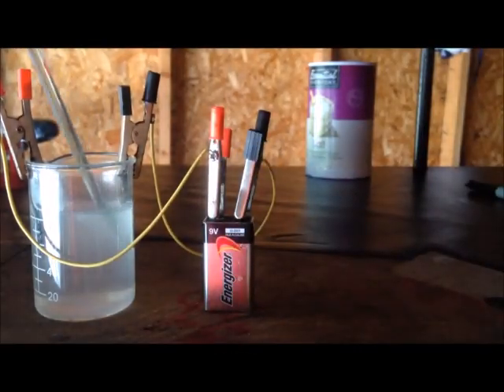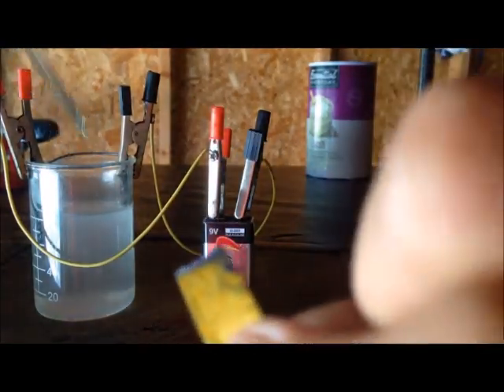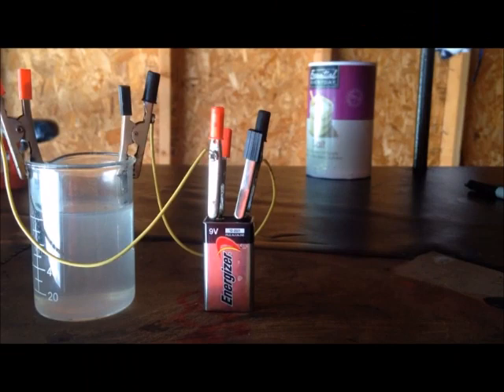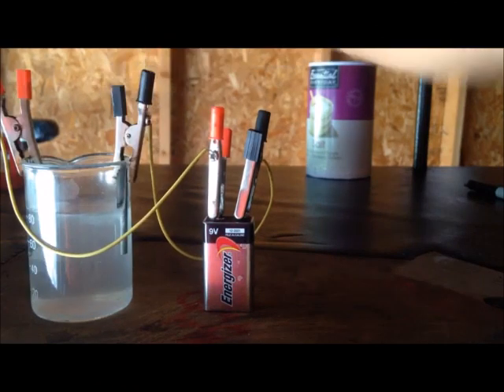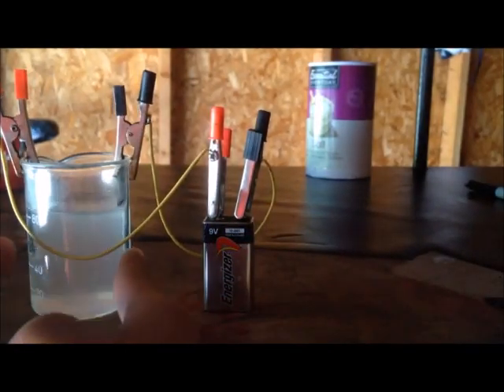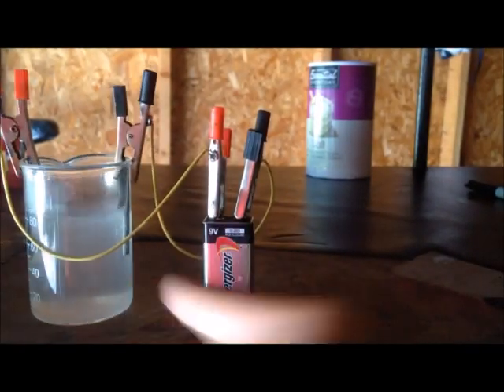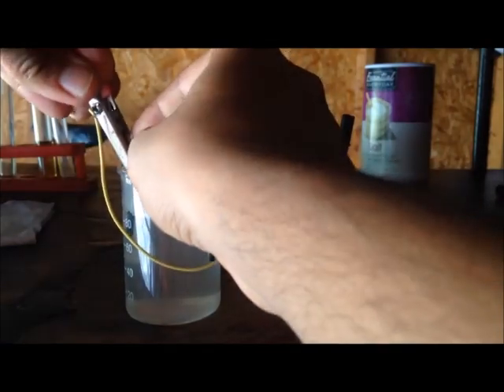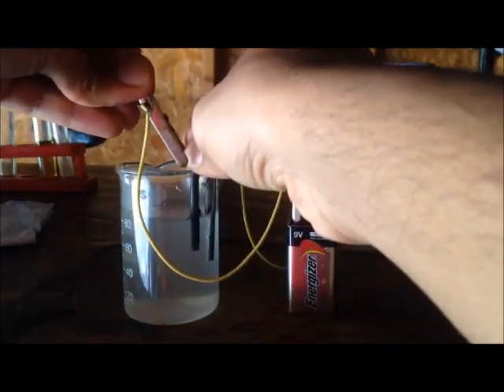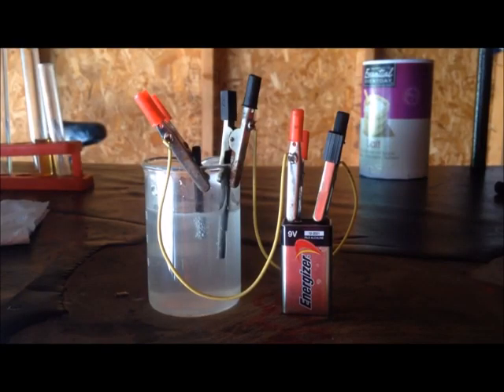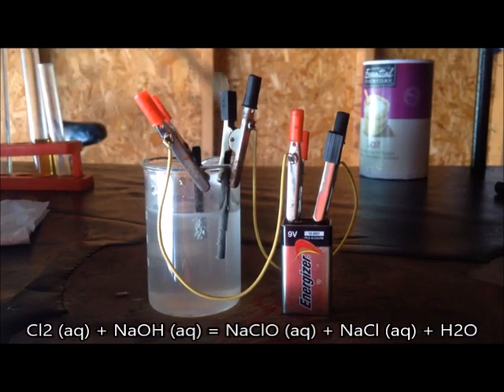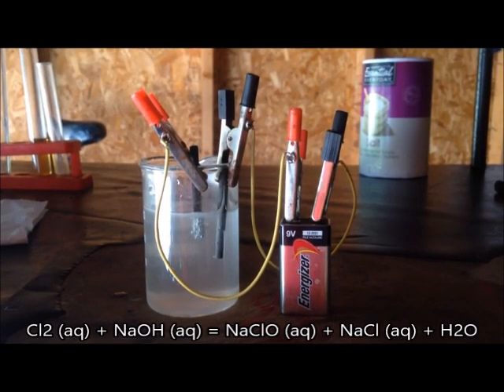To form bleach, we need a second reaction. These electrodes are a little apart from each other, so I'll move this anode near the cathode. The second reaction is between the chlorine gas from the anode and the sodium hydroxide in the solution. The two will react to make sodium hypochlorite or bleach and other products like sodium chloride and water.